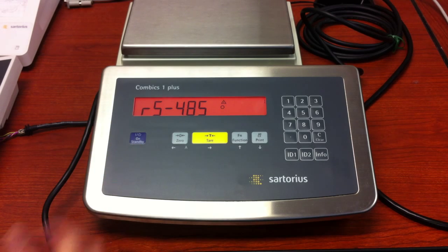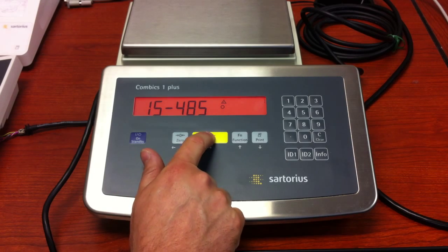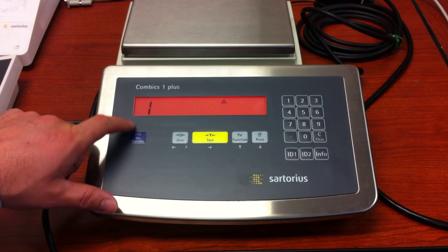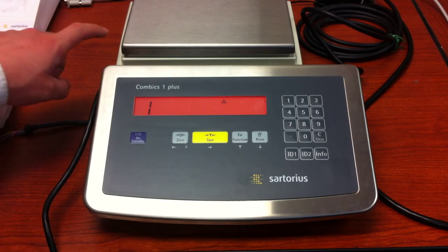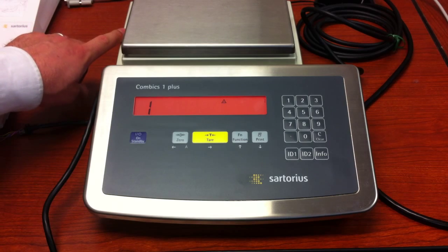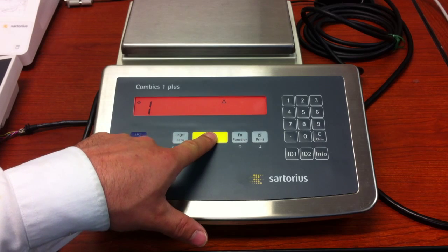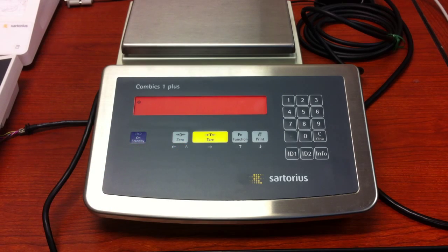We're going to follow that path — it does go to IS-485 right after that. Press and release the tare key again. As soon as you see the number one, you know that you're inside the menu of your IS platform. At this point, press and hold the tare key until the unit resets, and now as you can see you're weighing again.